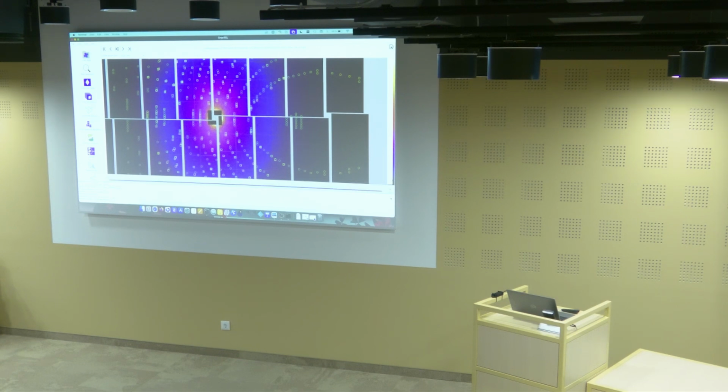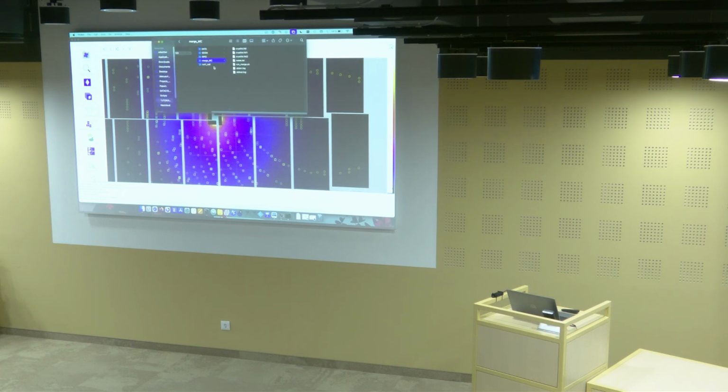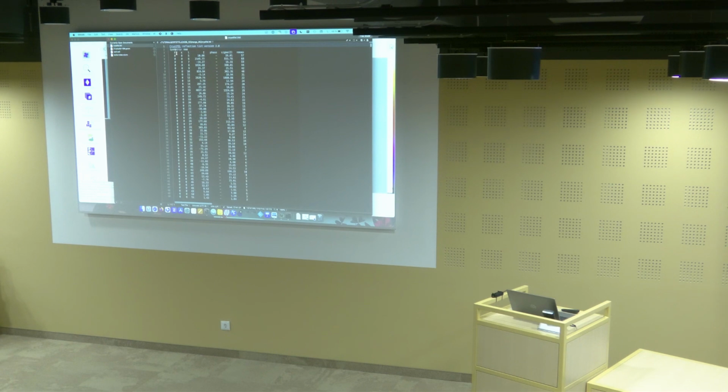And it's on. If we look again in our output folder, we have an additional folder, which is this one. It again has a run merge script, so that if you want to do this on the command line, it's very easy to find the parameters. And now we have this HKL file. Let's just open that. This is the file that we basically want.